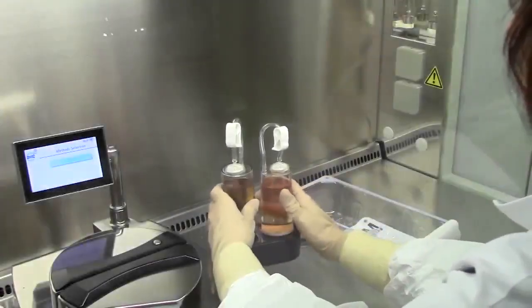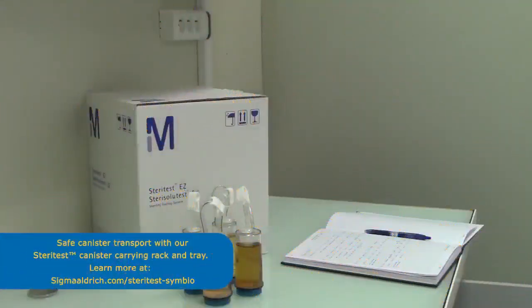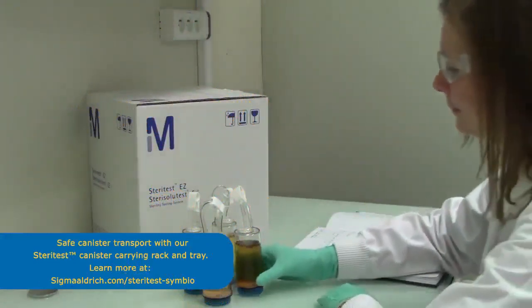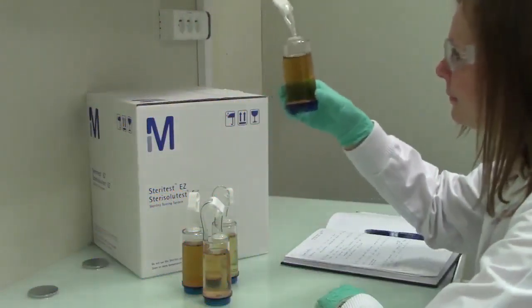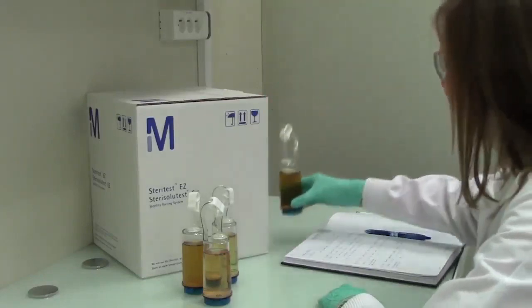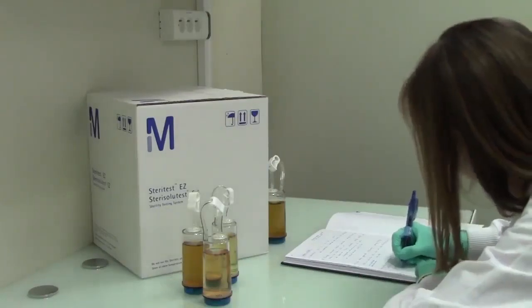Incubate canisters in accordance with applicable pharmacopoeia recommendations. At intervals during the incubation period and at its conclusion, examine the media for macroscopic evidence of microbial growth. If the material being tested renders the medium turbid, so that the presence or absence of microbial growth cannot be readily determined by visual examination, 14 days after the beginning of incubation, transfer portions of the medium, each not less than 1 milliliter, to fresh media and incubate for not less than 4 days.